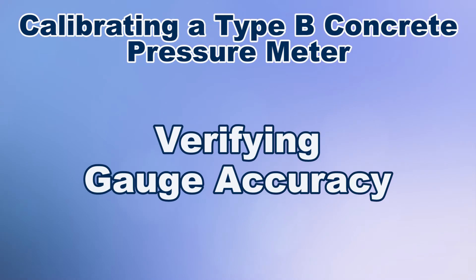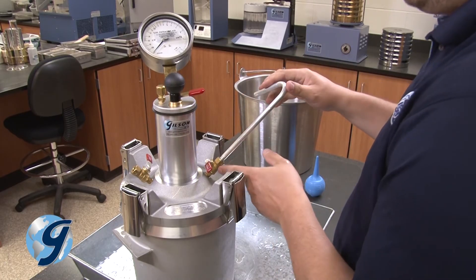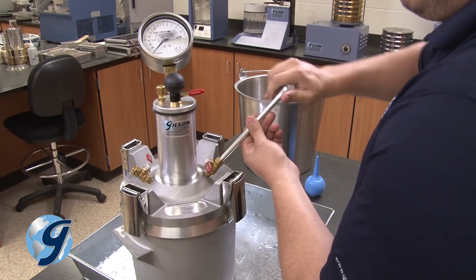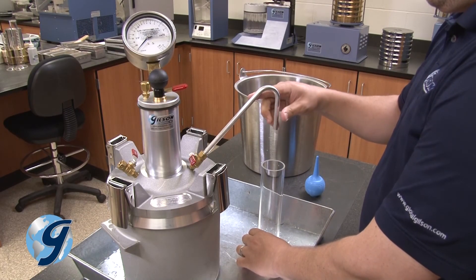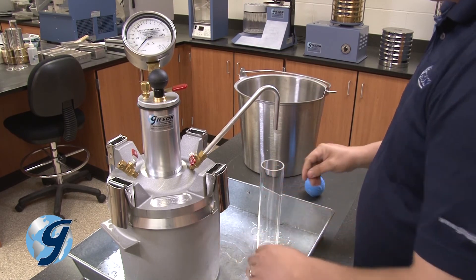Once the initial pressure is verified, screw the bent calibration tube into the top side of the petcock that already has the short tube fixed to it below, making sure that the bent tube opening faces down. Now, place the empty calibration vessel directly under the bent tube.